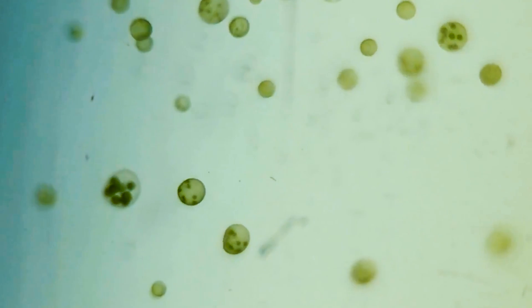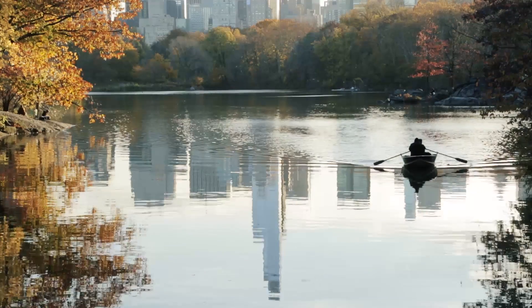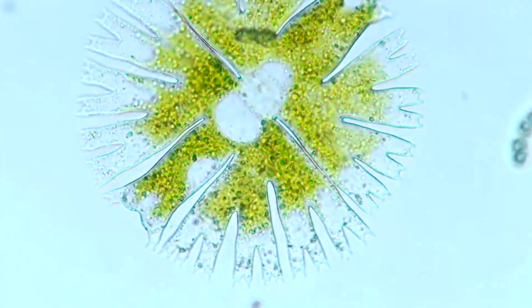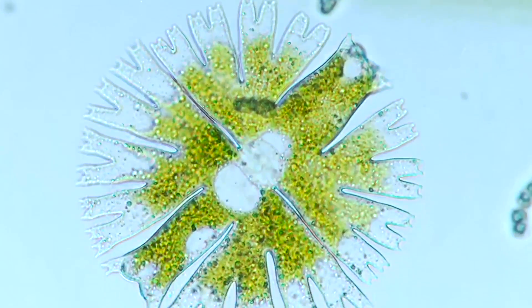I'm Eun-Soo Kim, assistant curator of microbial diversity and systematics in the Division of Invertebrate Zoology. So you can find algae in most of the aquatic environments, like pond water in Central Park. You just put a drop of water on the microscope slide and take a look at them, then you will find at least some of them swimming.